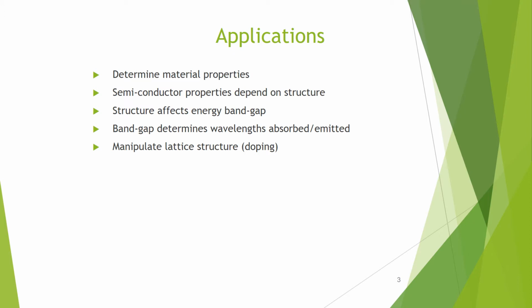We can find these semiconductor properties by using XRD techniques. Structure effect on energy band gap can also be calculated using XRD. Band gap determines the wavelength absorbed or emitted. It is also used to manipulate lattice structure.